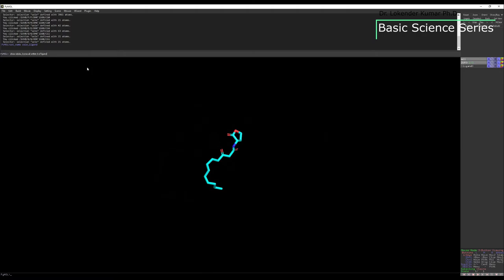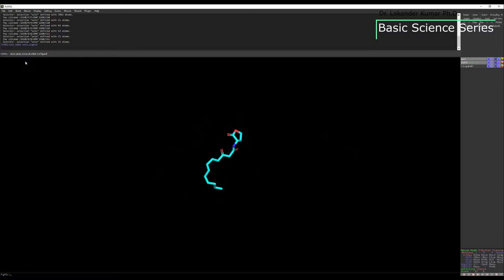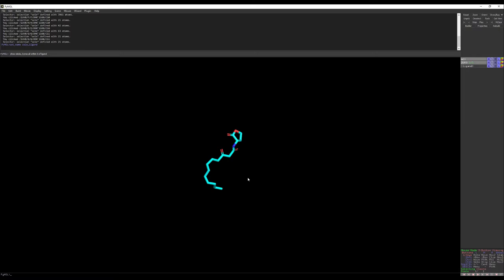The command I'm going to use is: show sticks, byres, all within 5 of ligand. All the residues present close to the ligand — within 5 Angstroms — will be represented as sticks. You can also change the distance to 3 Angstroms. The full command is: show space sticks comma space byres space all space within space 5 space of space ligand.